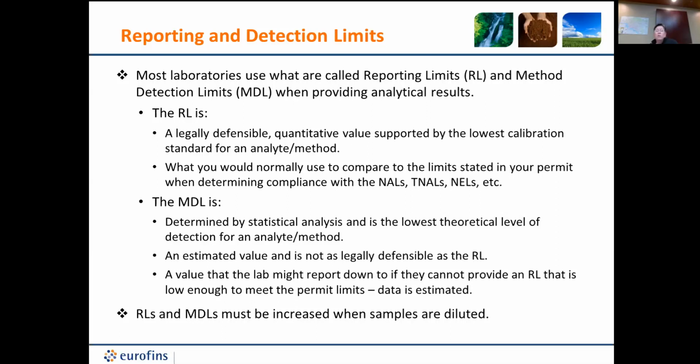And I know that in certain areas, there are some challenging constituents of concern out there that they want reported at a very, very low number. So sometimes labs are going to have to use an MDL. Just make sure that your regional board or your person out there is okay with that and they understand that.